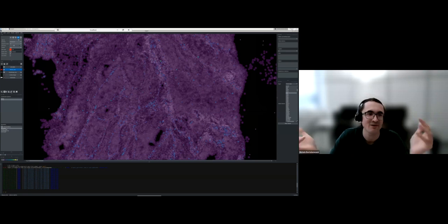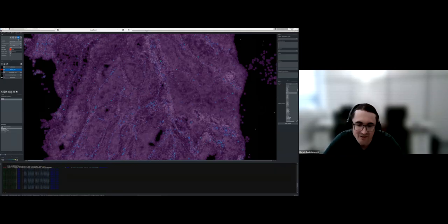Because even if it is very efficient, getting to billions of points is a lot, and even showing 1 million or 100,000 transcripts at a time for visualization purposes is generally enough, unless you are really looking at a really rare transcript, where you want to select those specifically or work on the whole set of points.